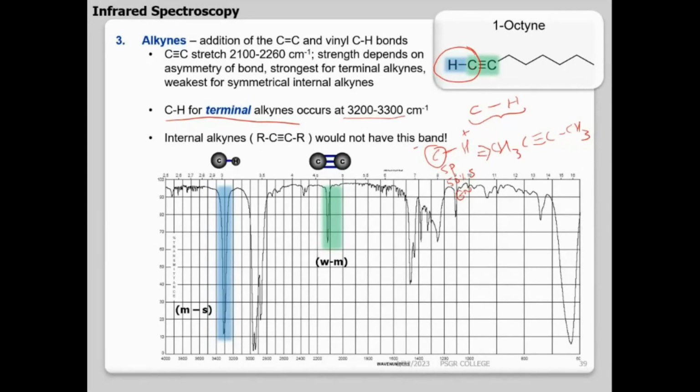Okay, so this CH, and the reason for its high value is, as already pointed out, that it has a very high dipole moment change. Why does it have such a high dipole moment change? Because the carbon to which hydrogen is attached is sp hybridized. That is one reason. The other reason is that the carbon is more electronegative. In OH, NH and CH, an ordinary alkane carbon CH need not come here. So that is how I differentiate. So I have an alkyne CH.